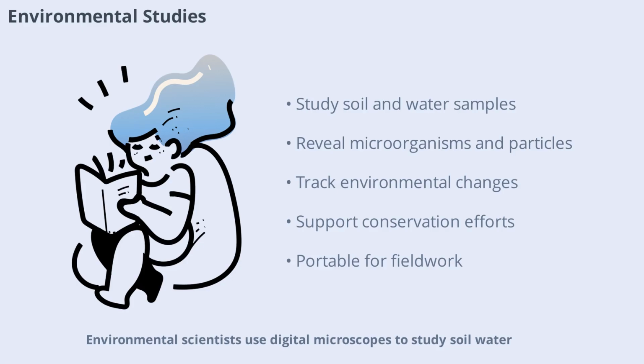Environmental scientists use digital microscopes to study soil, water, and air samples. Magnified images reveal microorganisms, particles, and pollutants that impact ecosystems. Documenting these findings helps track environmental changes and supports conservation efforts.